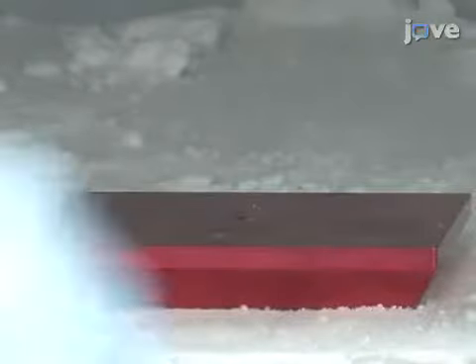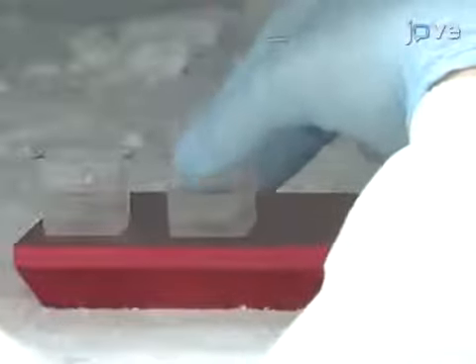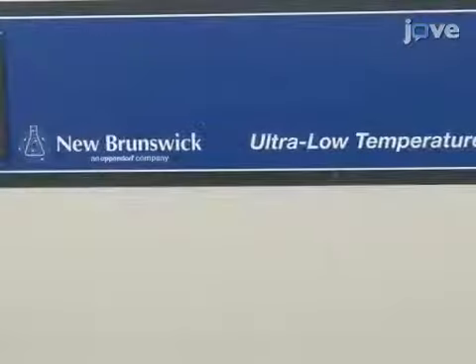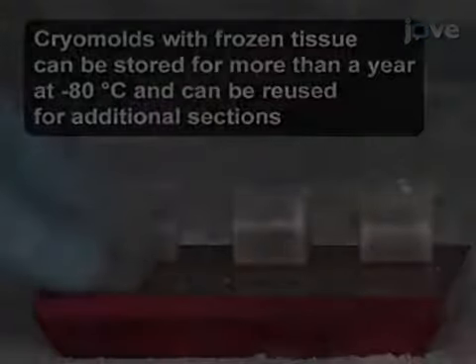Transfer the cryoblocks onto a metal plate in the -80-degree freezer to prevent floating and dislocation of the tissue. Monitor the freezing process to maintain the orientation of the skin at the bottom of the cryomold, since unseen air bubbles can cause the skin to rise.